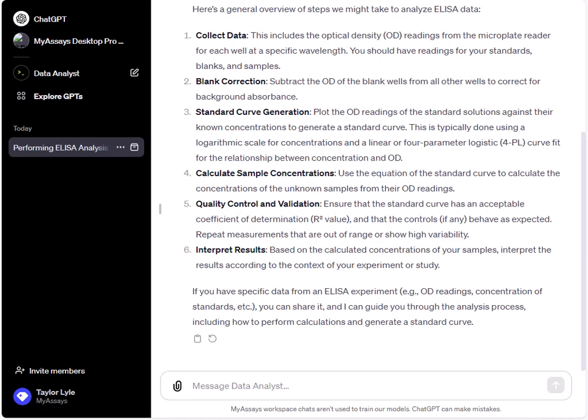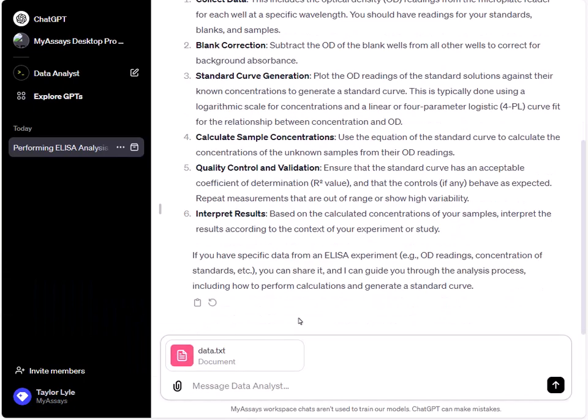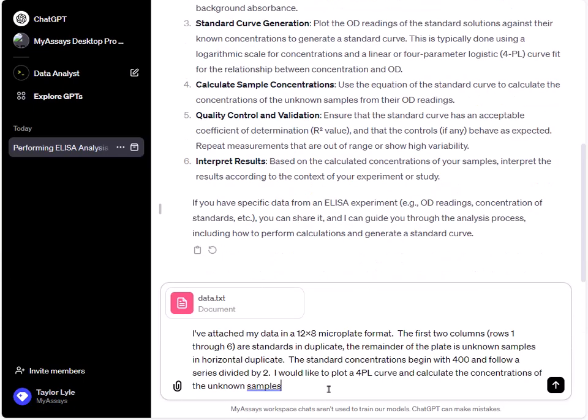I'll upload the text measurement data file by attaching it to the text box and provide additional information about my analysis. For this prompt, I've added, I've attached my data in a 12 by 8 microplate format. The first two columns, rows 1 through 6, are standards in duplicate. The remainder of the plate is unknown samples in horizontal duplicate. The standard concentrations begin with 400 and follow a series divided by 2. I would like to plot a 4PL curve and calculate the concentrations of the unknown samples.